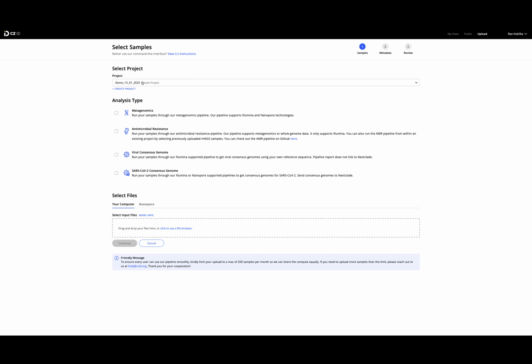So, for example, if you have an ongoing project since two months or something, and you've uploaded data already, you have to make sure that the same database version is used within the whole project. Otherwise, you can't compare your results. So make sure to add the data always to the right project here.